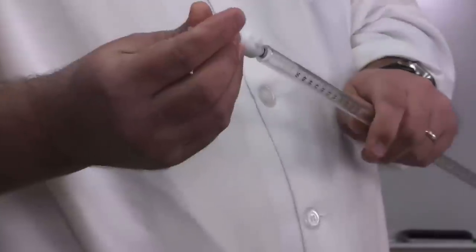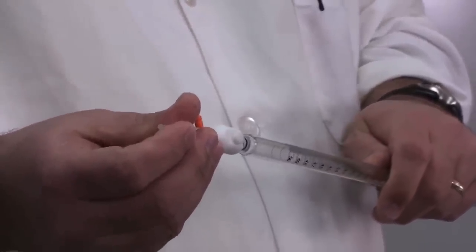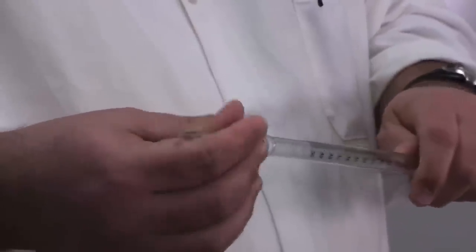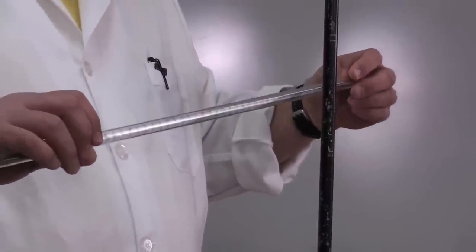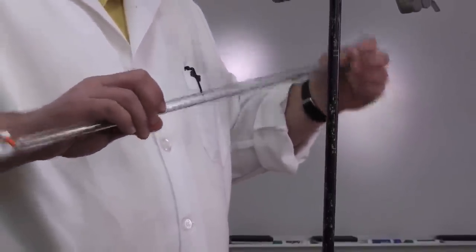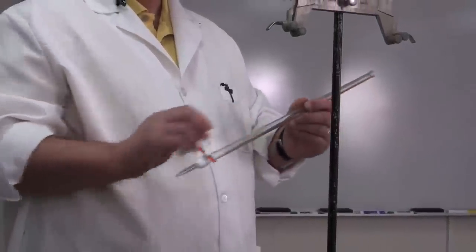These burettes have interchangeable parts. Sometimes those parts come loose—if they come loose during your experiment, that's a mess. So make sure everything is on tight, make sure the stopcock is closed. Then we're going to put a little permanganate solution in the burette just to rinse it out, get any dust out, then we'll empty it and fill it up.